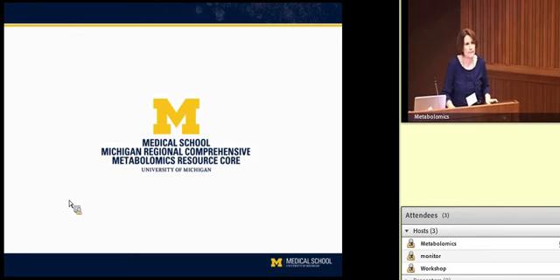I've been doing a little bit of LCMS, and I had a question. If I had 100 different samples to be run in the same run, and I'm dealing with human samples, the quality control that I've been using is just one sample that I run every time I do an assay, maybe after every 30 samples. Is there any other quality control, because I don't know if something's going to happen to the assay after, say, 150 samples?